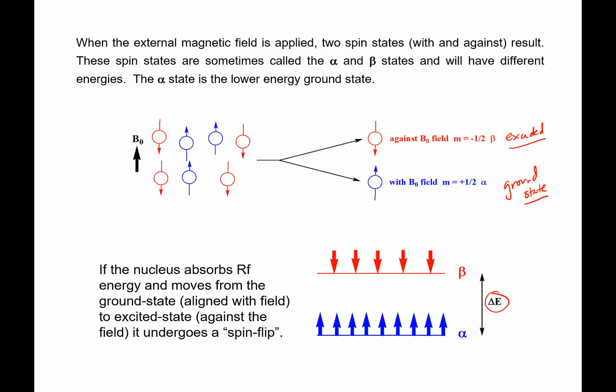As I'll show you later on, if it's in the excited state, it's not there forever. Somehow it's got to lose its energy and go back to the ground state. That's actually the principle behind MRI. I'll remind you of that in a few minutes.